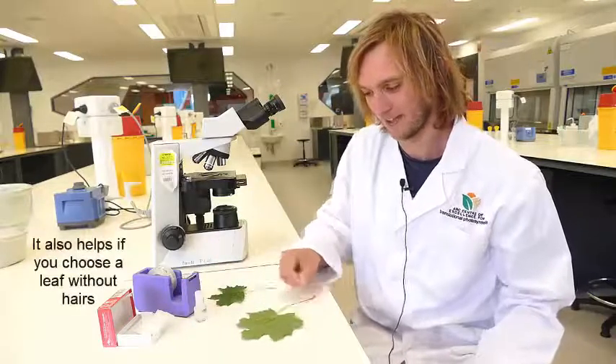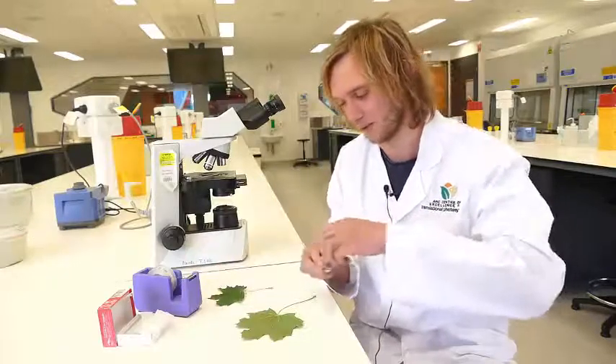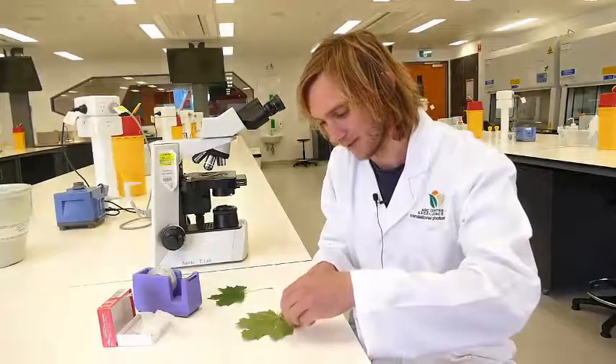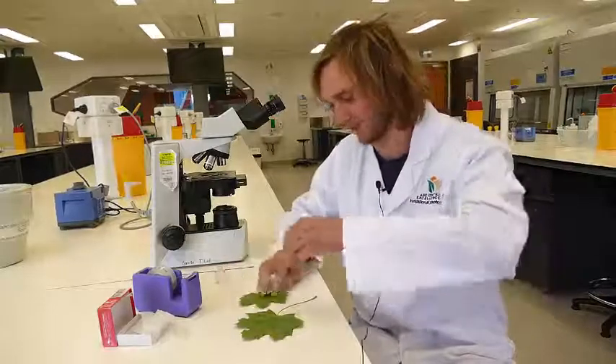Now let that dry. While it is drying, you can prepare a few more leaves and look at a few other leaf samples while waiting.